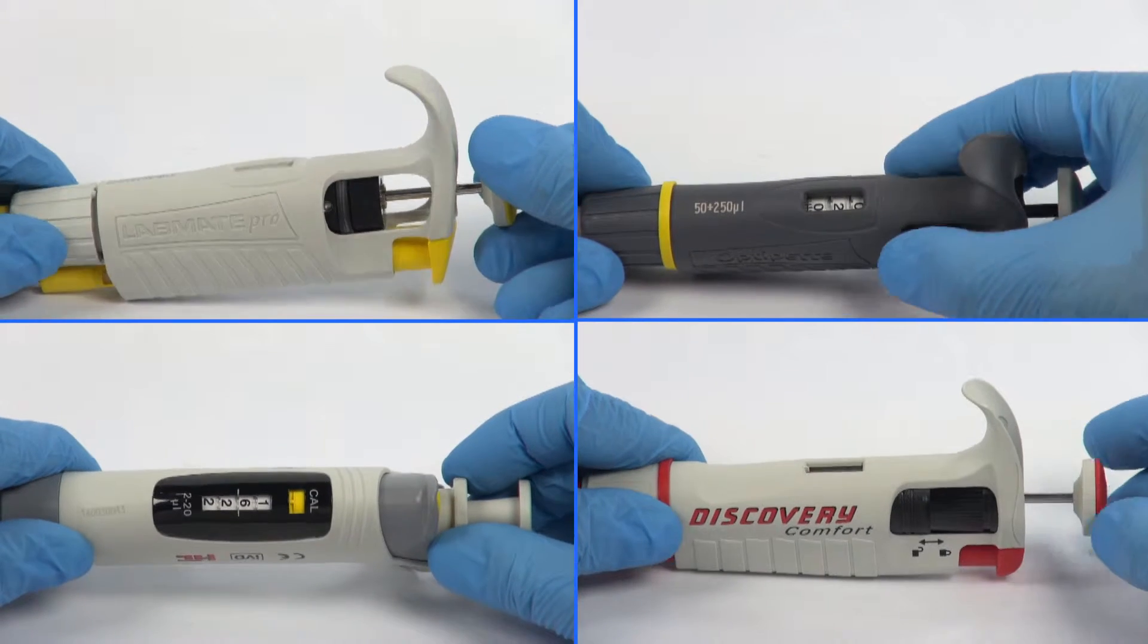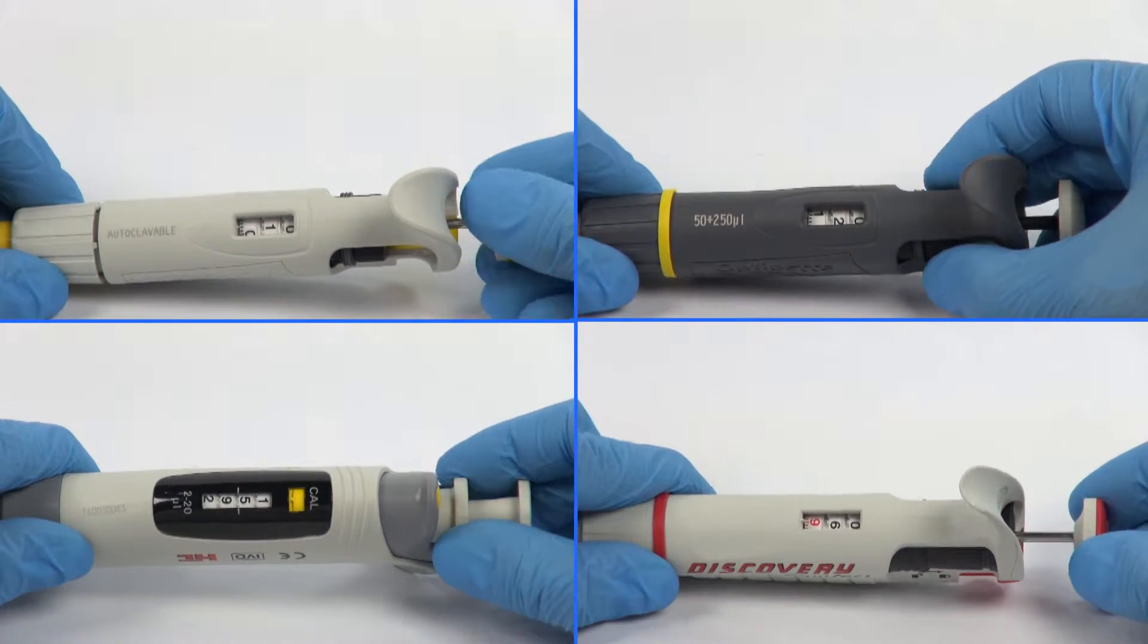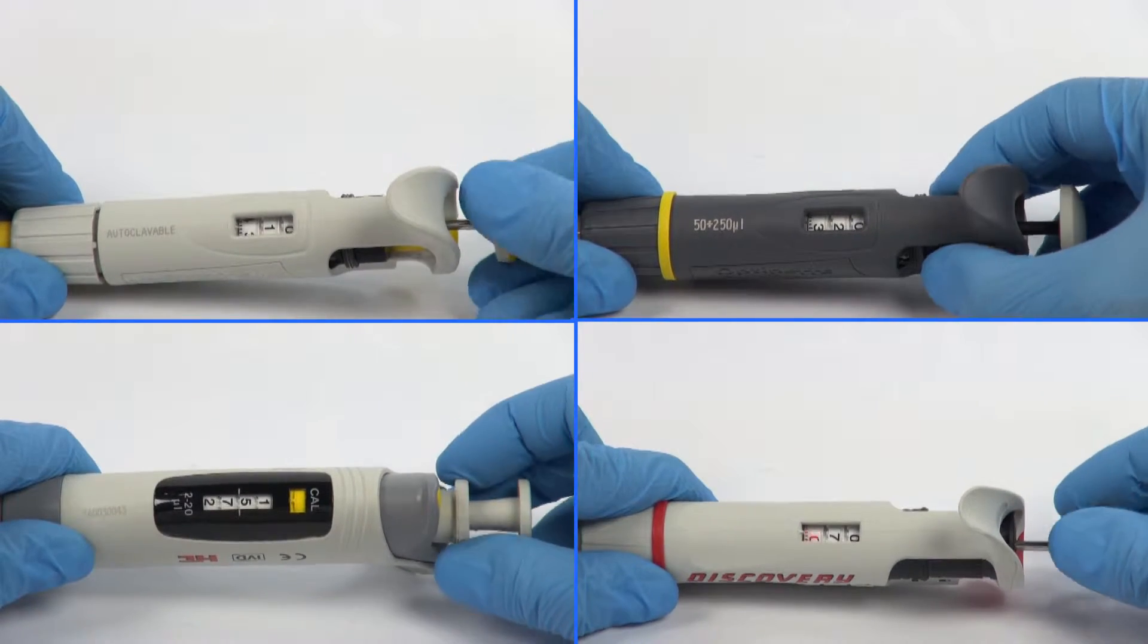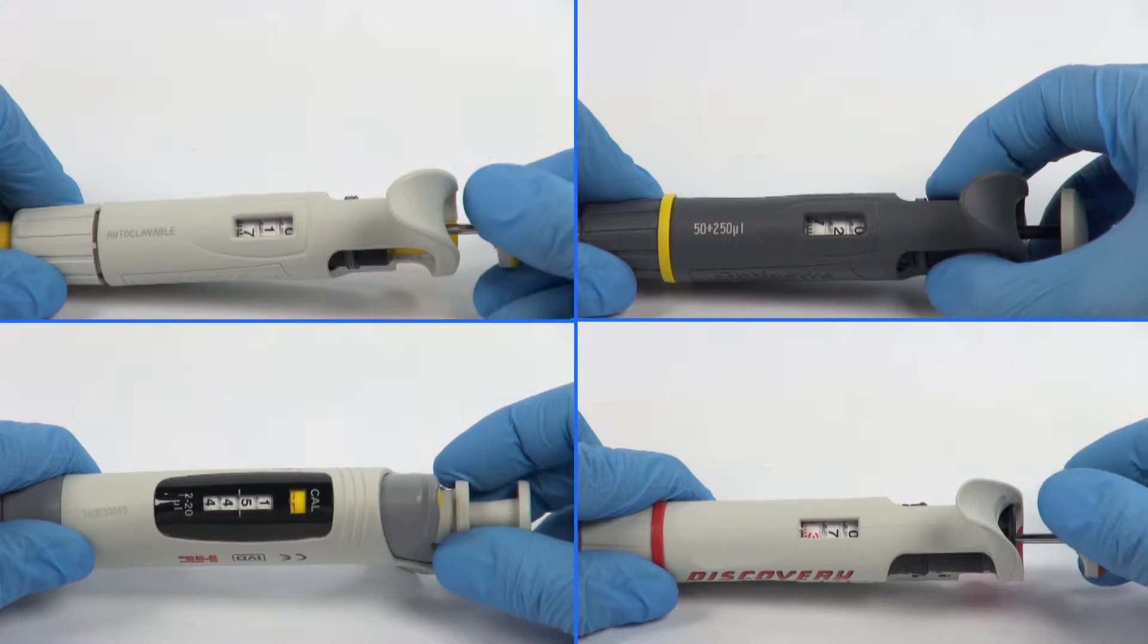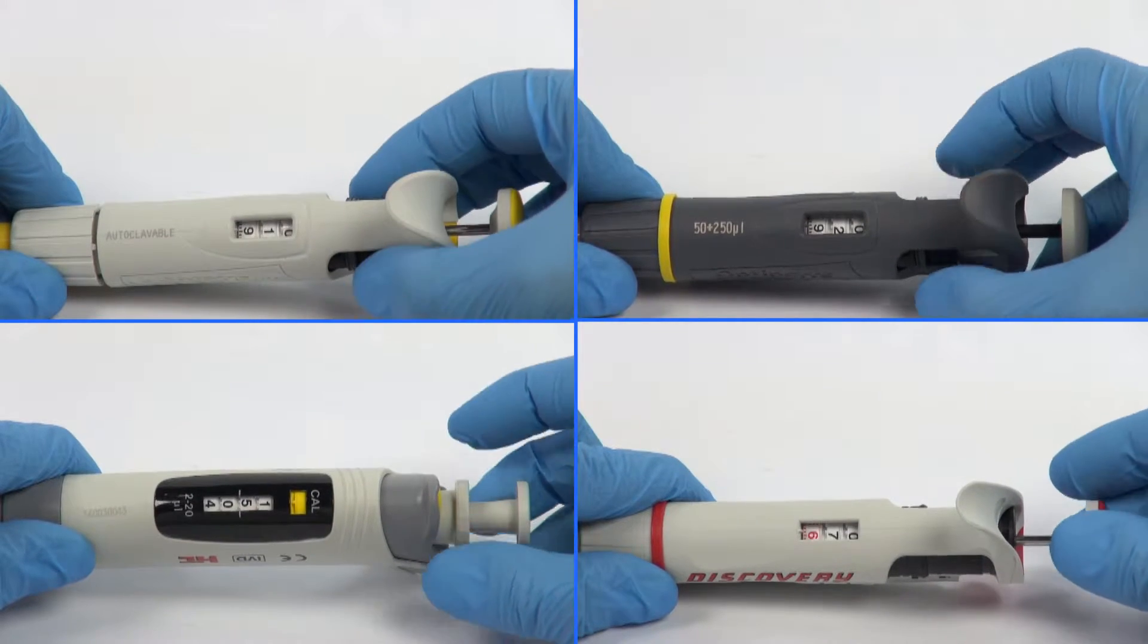Depending on the pipette model, the volume setting can be done either by the pipette push button or by the volume adjustment knob.